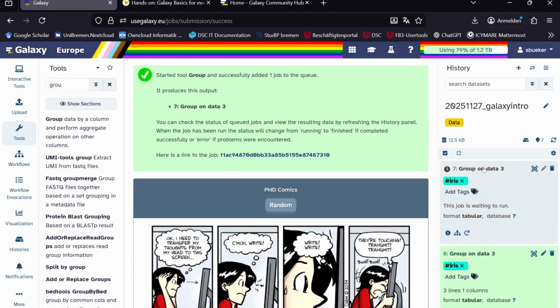Additionally, you don't have to note everything you did. So you don't have to have your own lab book, for example, or wherever you store these notes for your analysis, text file, whatever, everything is already in here. So it really saves time for us.